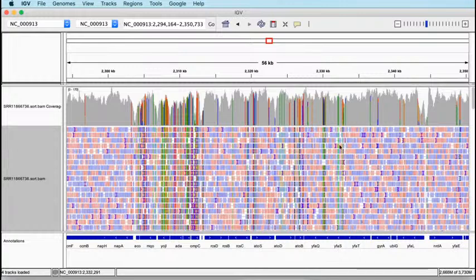Next time out, we're going to think a little bit more about these points of variation that we see in this genome. So in our alignment versus our reference genome, we are seeing places where the reads which we've aligned exhibit variation compared to the reference genome. And in session number 48, we're going to think about that variation and how we might pin that variation down using some sort of statistical framework.